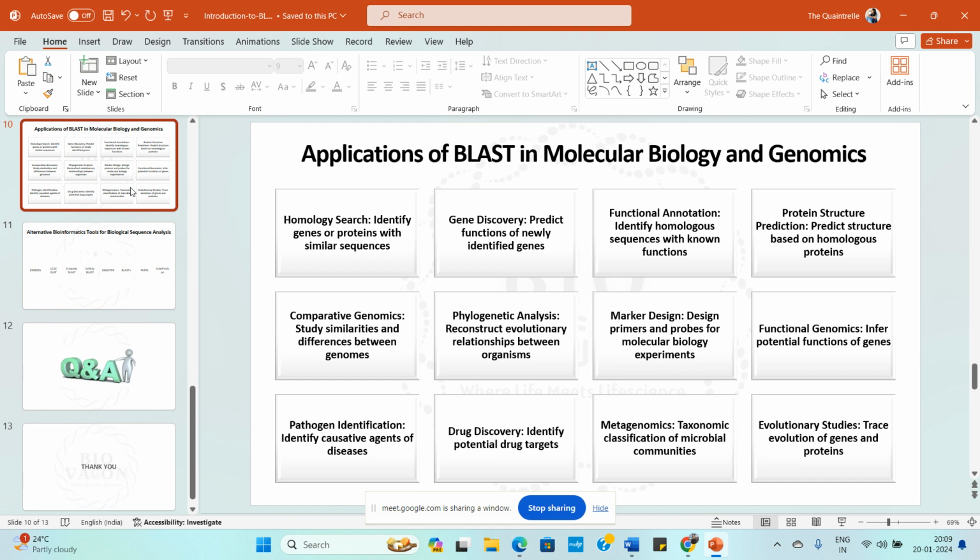Like I said previously, BLAST depends on what kind of research you are using it for. I have named some of the applications, but when you are doing big research, like transcriptome or Sanger sequencing, whatever it is, ultimately it will come and end with a BLAST. It is the basic thing and the easiest thing to learn when you want to learn bioinformatics, because we'll be starting more bioinformatics classes, so that's why I started with BLAST.